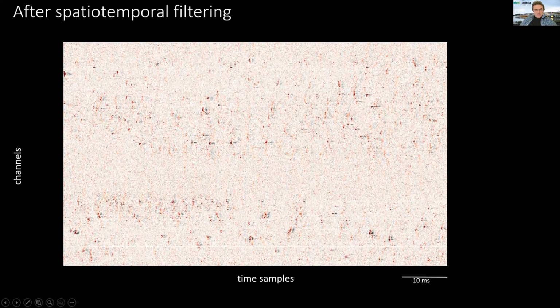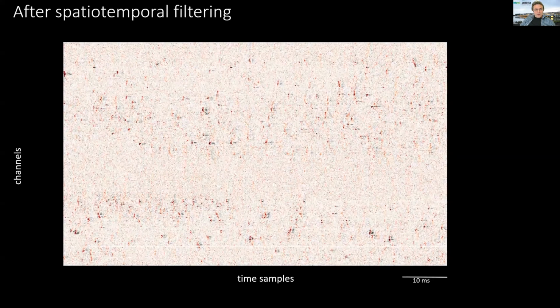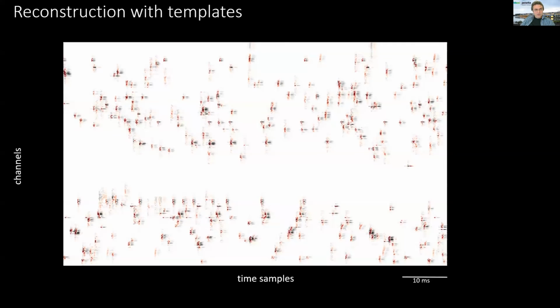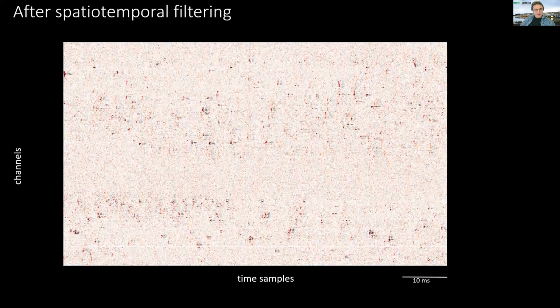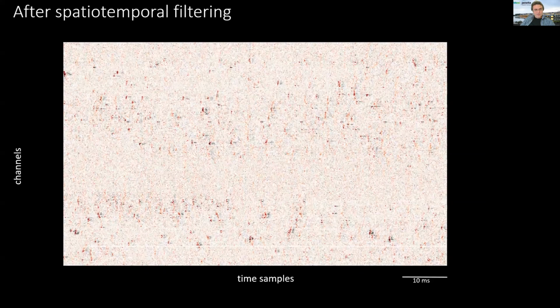This is the actual data Kilosort uses, and those little events are in fact standing out over noise quite a bit, and we're able to detect them. After detecting them, we can so-called reconstruct the data using our templates, and you can see, if I go back and forth, that where some of the artifact-looking spikes were, we've identified the presence of a template from a particular neuron.